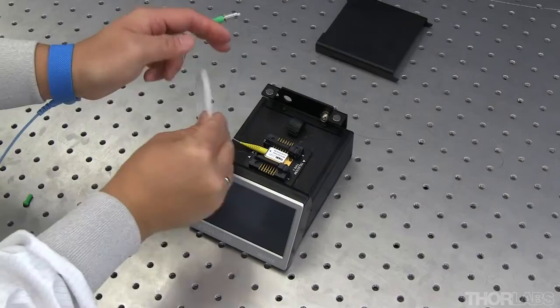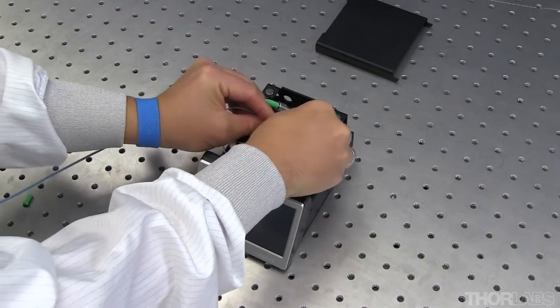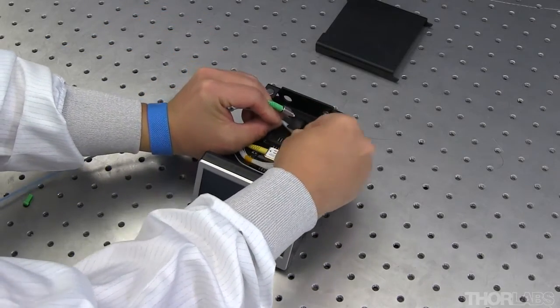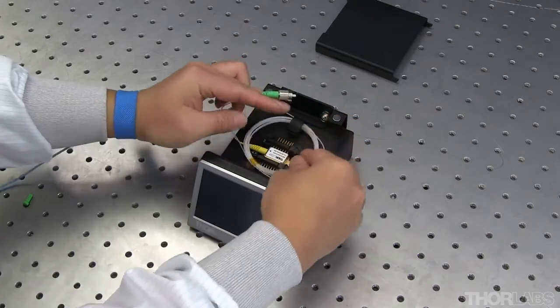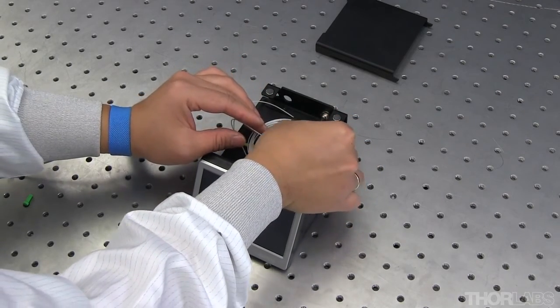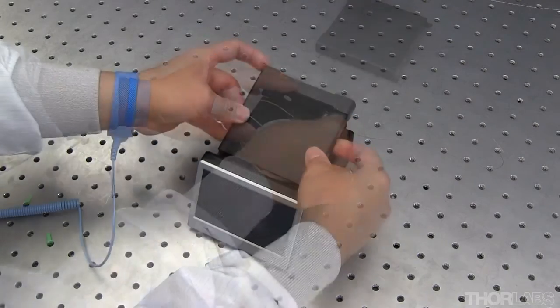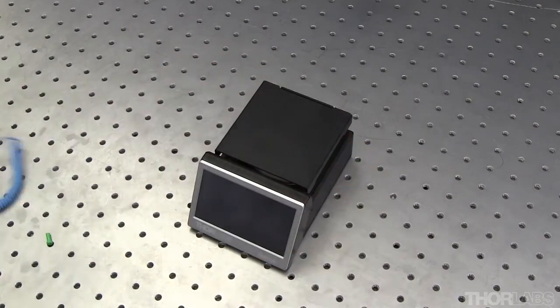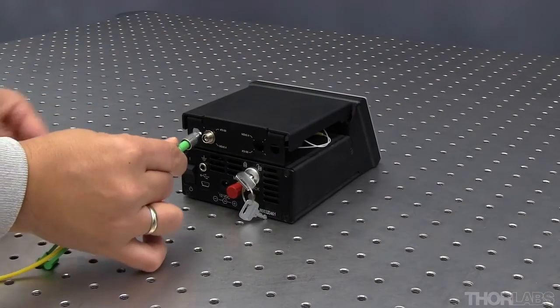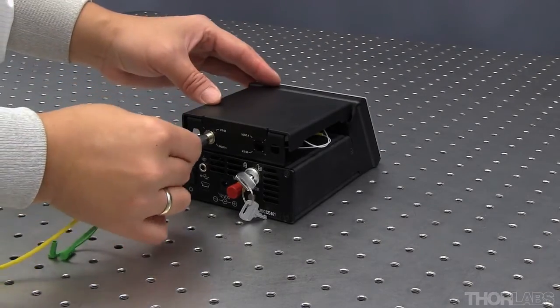Attach the end of the pigtail to the connector on the inside of the controller. This will help prevent any unnecessary stress on the fiber, protecting the laser from damage. Attach the fiber patch cable to the connector on the outside of the controller.